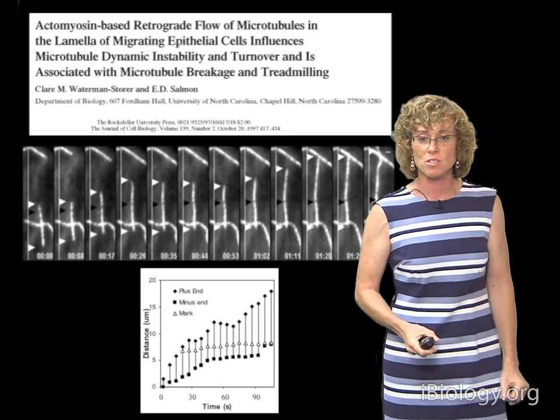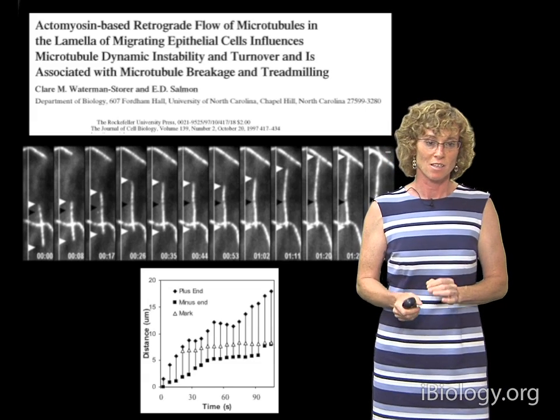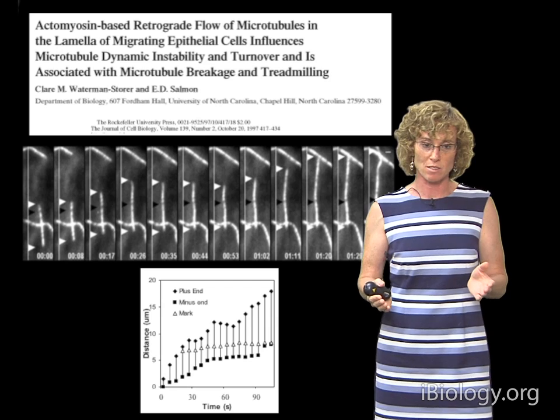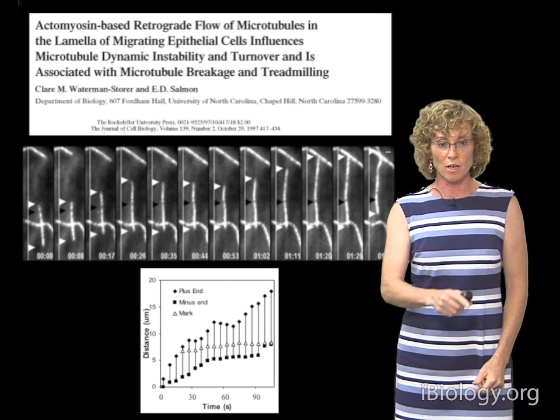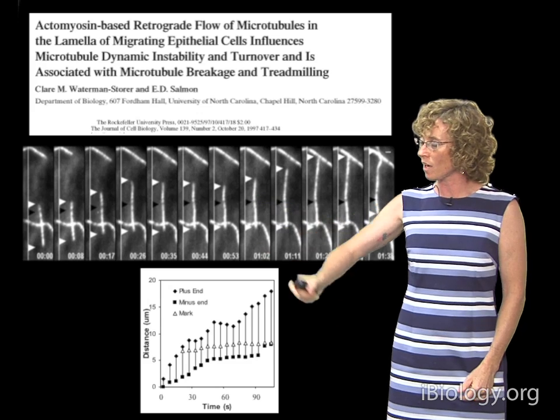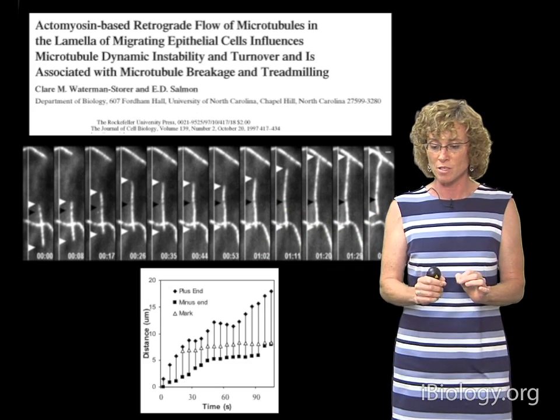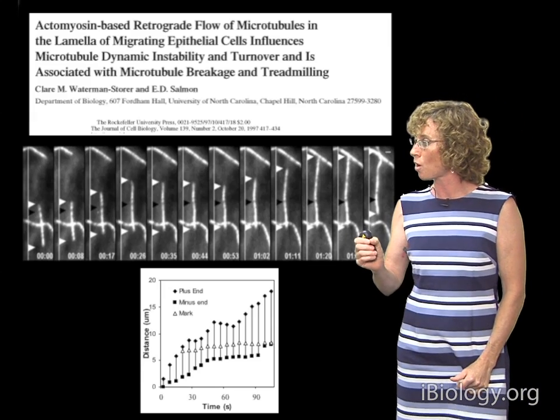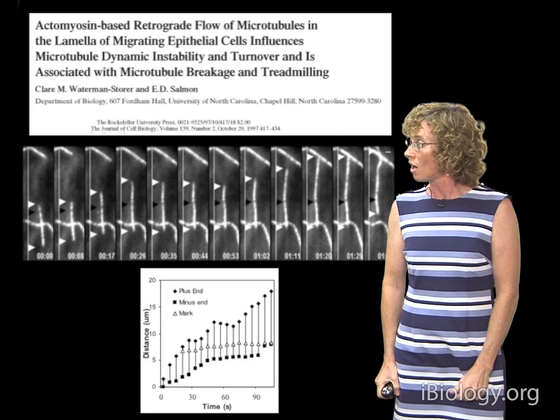So I'm going to give you a little history because it's a good history lesson. We discovered this technique by accident, okay? I was a postdoc in Ted Salmon's lab. I was studying the dynamics of fluorescent microtubules in migrating epithelial cells, and we had a 100x microscope objective lens and new cooled CCD cameras with a small pixel size that allowed us to get full diffraction limited resolution in the camera image.